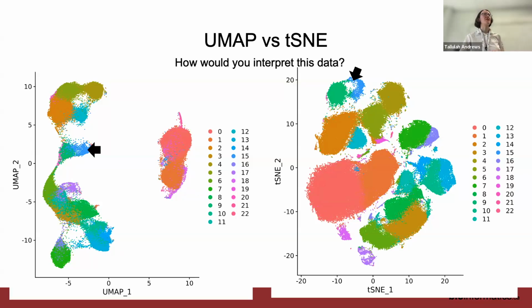We'll come to that when we do clustering. So the question was, because we did clustering, don't we know already for sure, because the clustering is done on the gene expression, or actually it's done on the PCA space, that these clusters really are different from each other? And I said, we'll get to that when we do clustering, but that's not necessarily true. But yes, it is more evidence that they are truly distinct from each other, that they're clustering separately. But there are cases where you can get things clustering separately that are not actually different.